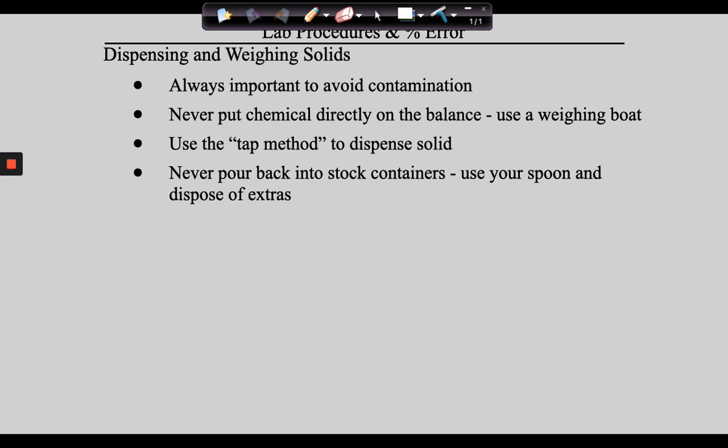And now we've got to think about this. This is what is called a chemistry spoon. If there's not one there and you bring your own chemistry spoon, this is contaminated.